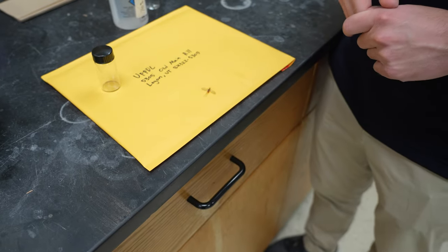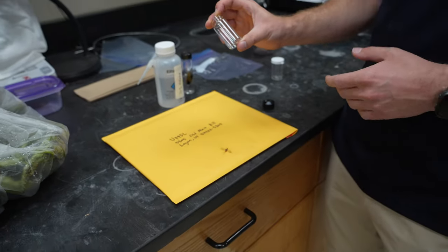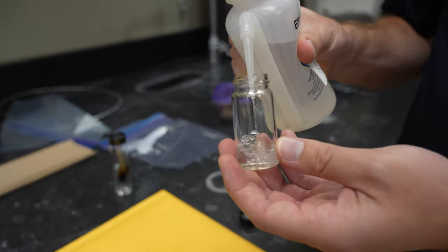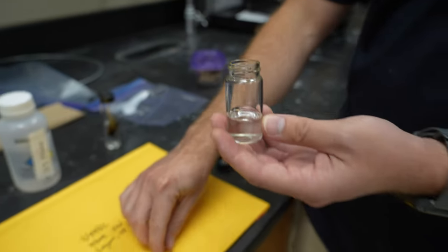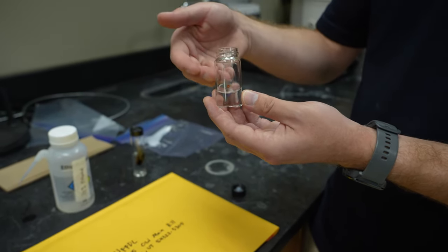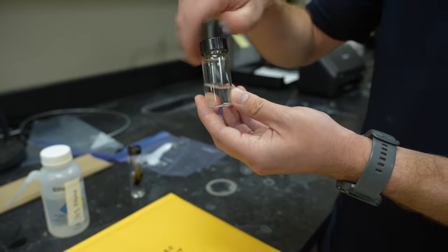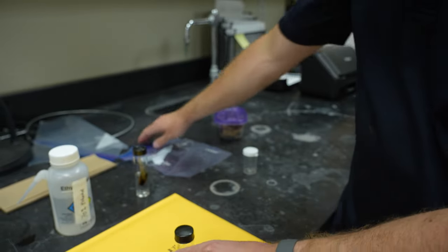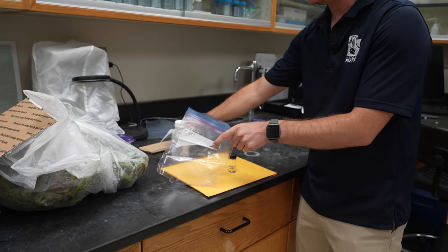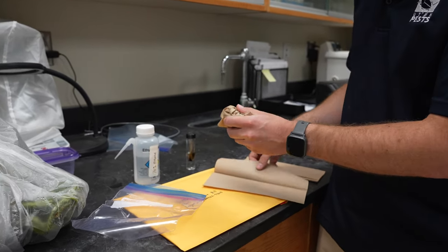Here we have an insect we want identified by the diagnostic lab. Take a container — something like a medicine bottle or another watertight container — and fill it with ethanol or store-bought rubbing alcohol from your local drugstore. You don't want to completely fill the container unless you have a very large insect; just enough ethanol to cover the body. If this were a freshly dead insect, it would sink to the bottom. Then seal the container and place it in a bag. Anytime you submit samples with liquid in the container, we recommend wrapping that vial in paper towels a few times just in case there are any leaks.